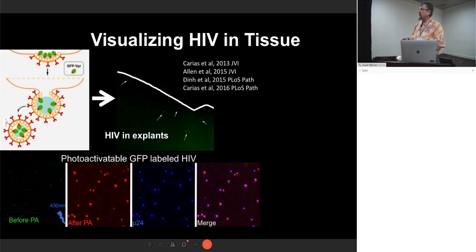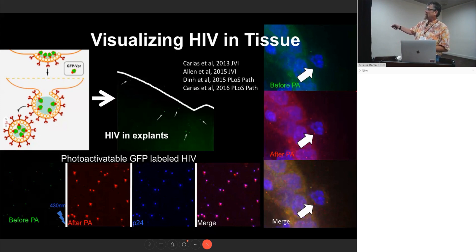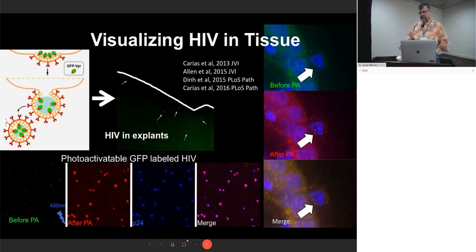We found a lot of background whether we put virus on or not — we saw little green dots. We solved that problem with photoactivatable GFP: you take a first scan and might see a couple spots that are background, you photoactivate and take the image again, and the viral particle will show up on the second scan. This is a really nice method to show there are intact viral particles.